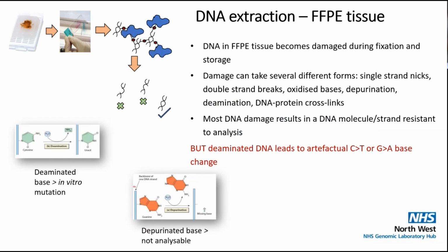So those are the kind of techniques we use. So a little bit about the input and what we're actually analysing and where this comes from, and all those factors that affect how well the test or which test we can use. So all our work in genomics starts with the extraction of DNA or RNA.